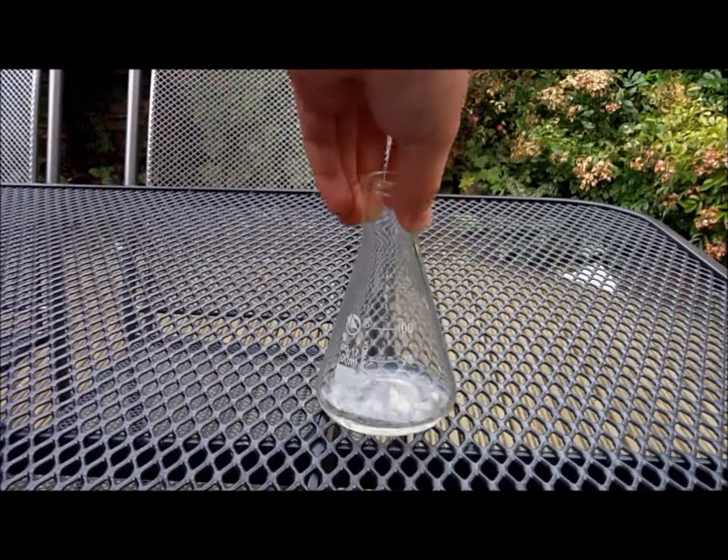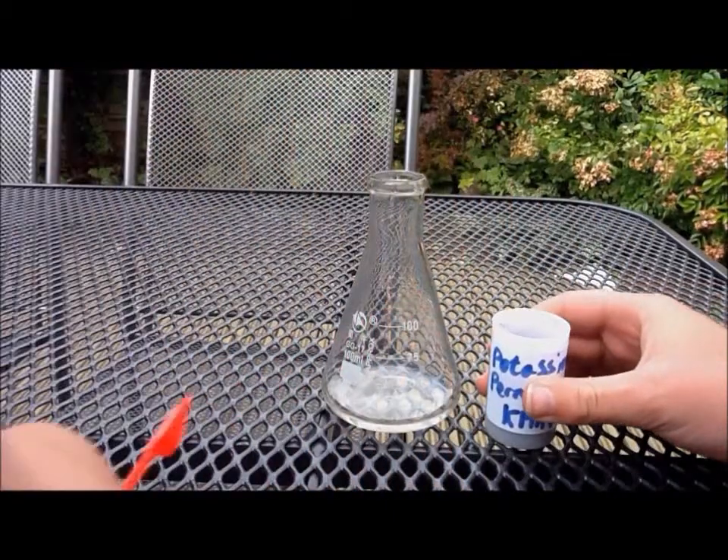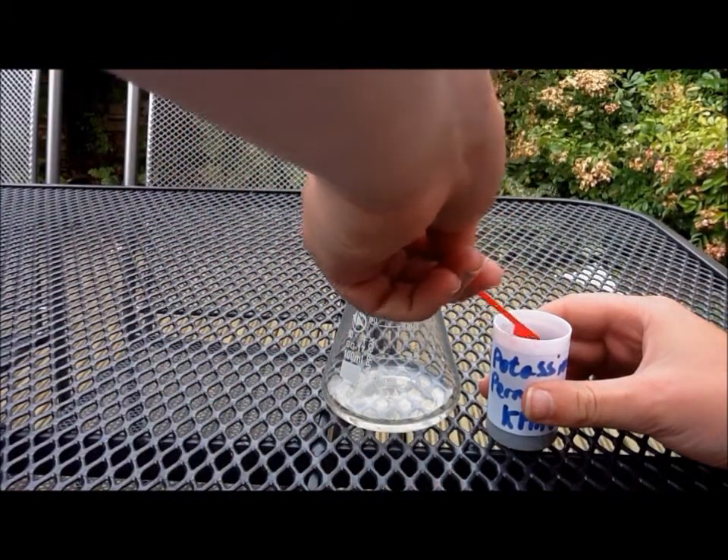You can see we have already got the peroxide in it. You need 10ml of hydrogen peroxide in your conical flask, and then you just need to add a tiny, tiny amount of potassium permanganate. One crystal would be enough, but I am going to use about 5 or 6 crystals.